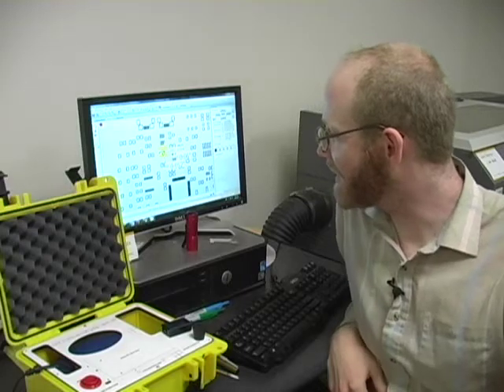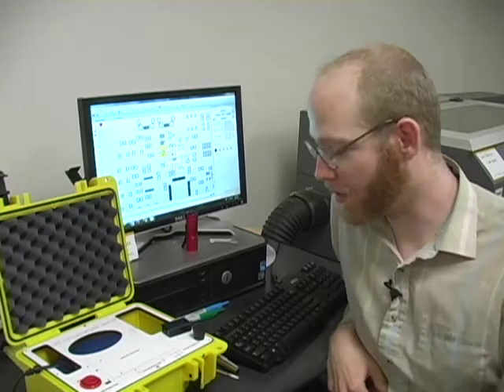I'm Matthew Lippincott from Public Laboratory, and I'm going to do some testing for formaldehyde at the laser cutting station I work at.